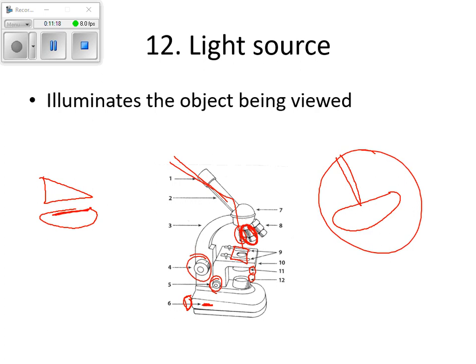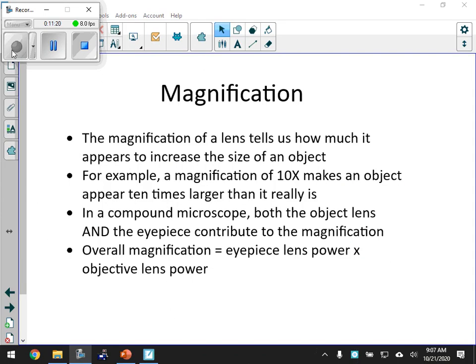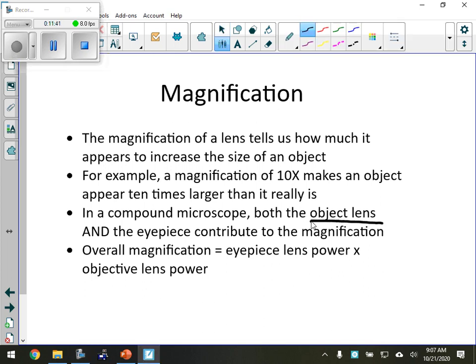Questions? Anyone? First here. It says here magnification. The magnification of a lens tells us how much it appears to increase the size of an object. For example, a magnification of 10 times makes an object appear, of course, 10 times larger than it really is. Okay? In a compound microscope, both the objective lens and the eyepiece contribute to the magnification. Okay? So both of those things contribute to the overall magnification.